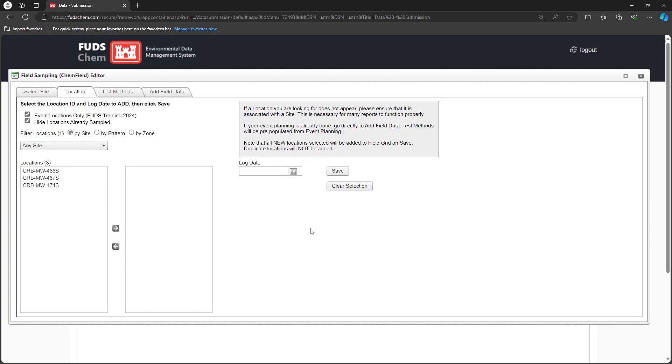For this example, we only have one CoC to enter, so we will only need one CHEM field file.